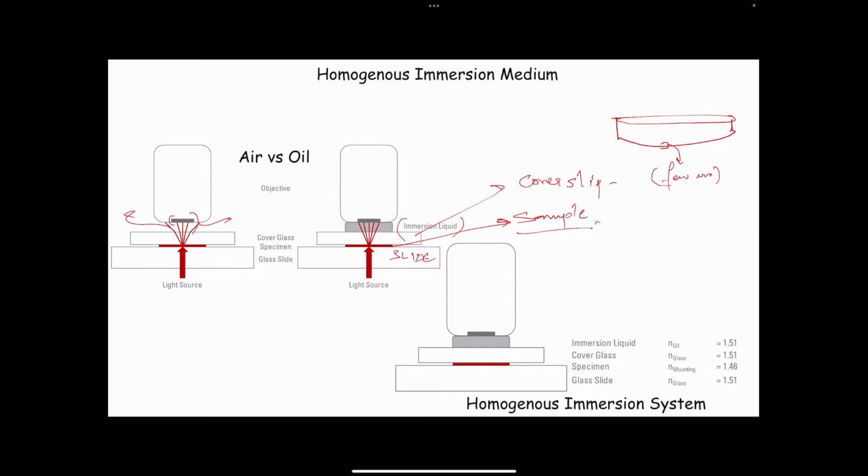And when we talk about animals or plants, which are very thick specimens, when you take the tissue specimen of your plants or animals, it is very thick. Often it includes a large variety of pigments or non-transparent materials which block your light and make your sample optically opaque. Now, any sample that has to be well studied with fluorescence microscopy needs to be optically transparent, because light microscopy works on the principle of illuminating the sample and then collecting the light from the same specimen to form the image out of it.